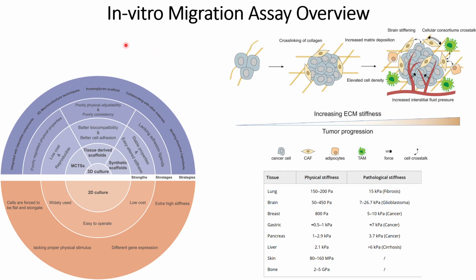Today we will discuss the in vitro migration assay overview. This is not a topic specific to a particular area, but we will understand how in vitro migration assays evolved with time, what the bases for these assays are, and which of them are most commonly used. So first we will start with the basis.